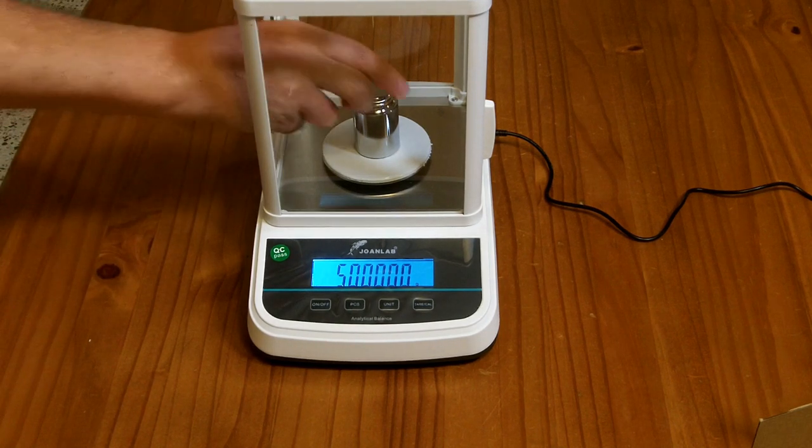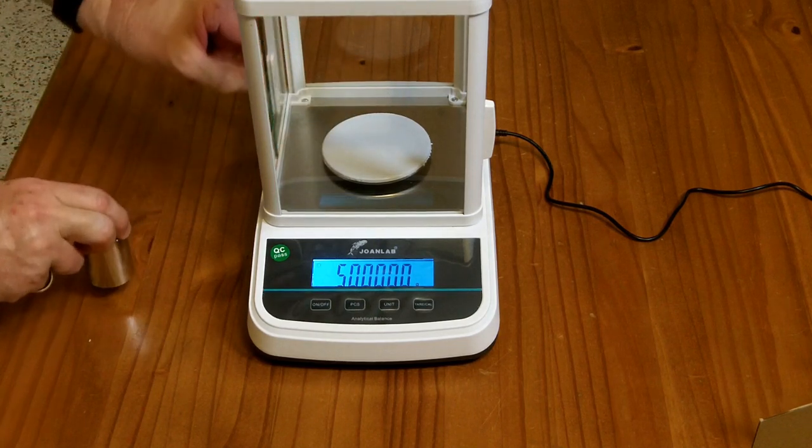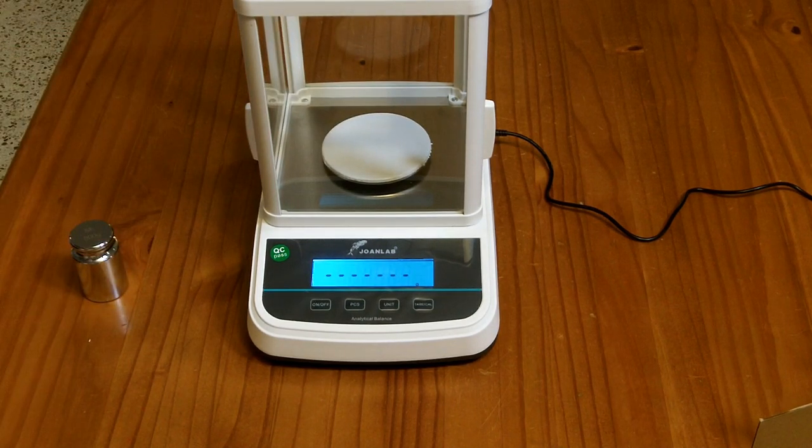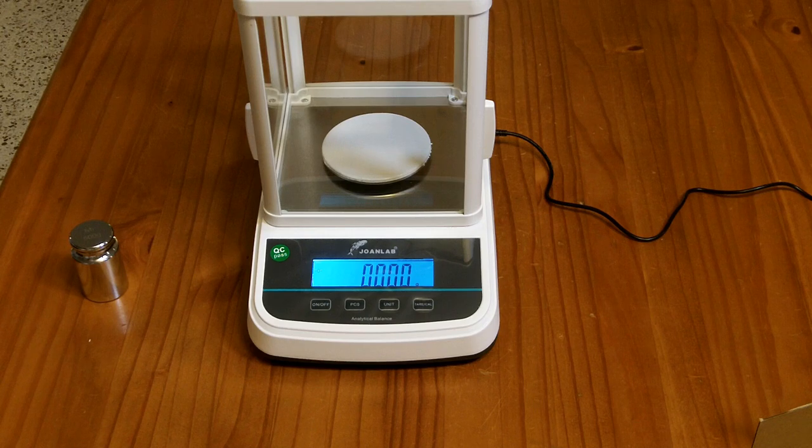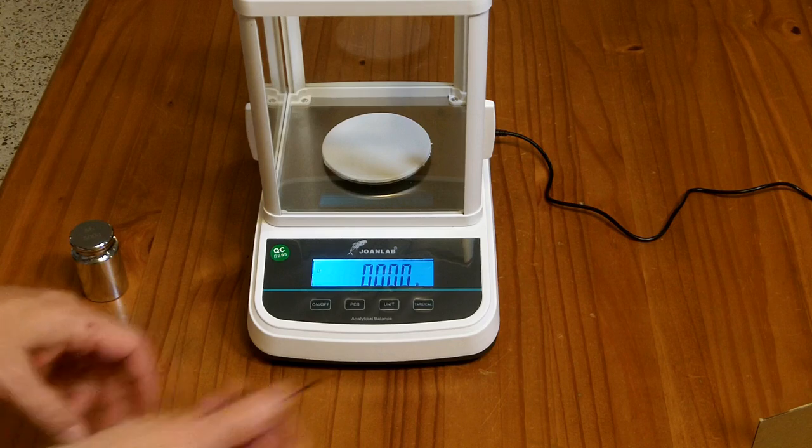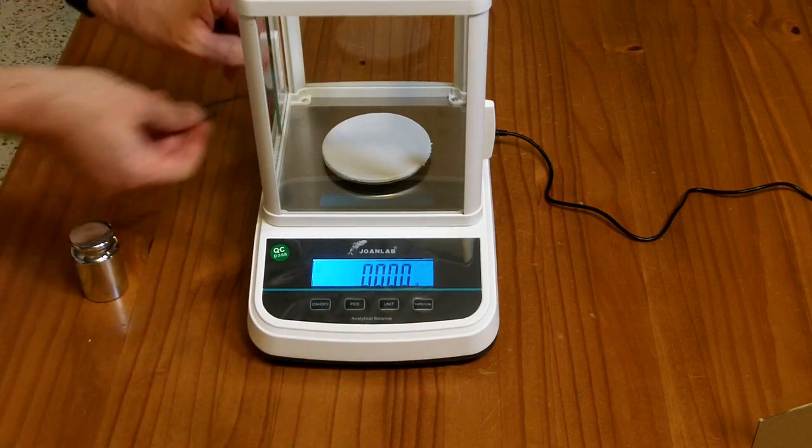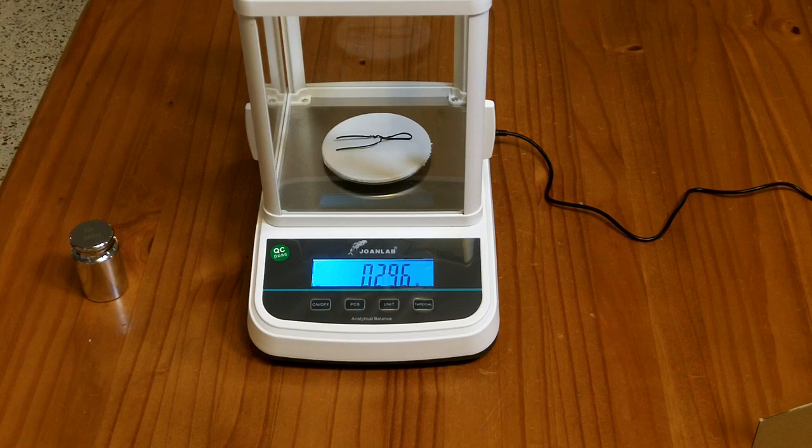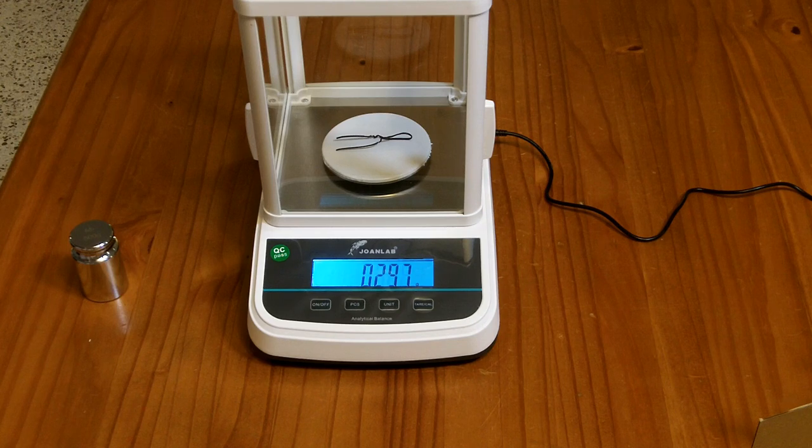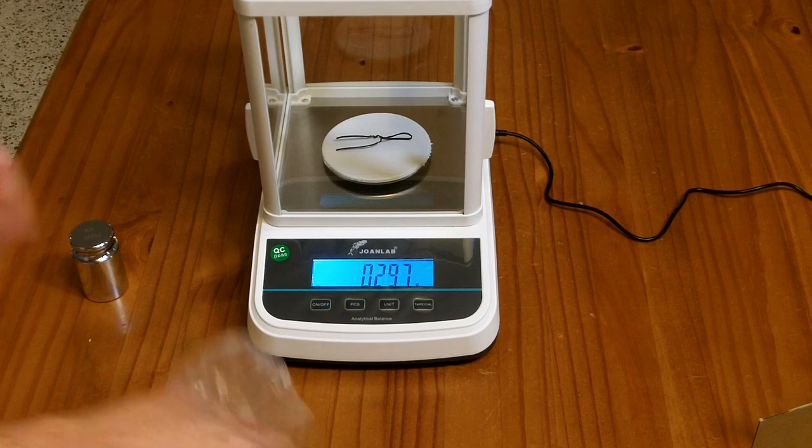Then we remove the weight. It thinks about it some more. And now it's at zero grams. So let's put this back on and see what it says now. So it's still .296. So it looks like, well, 296 to 297. So maybe it changed the lower end a little bit. Looks like it might have mostly calibrated the upper end.